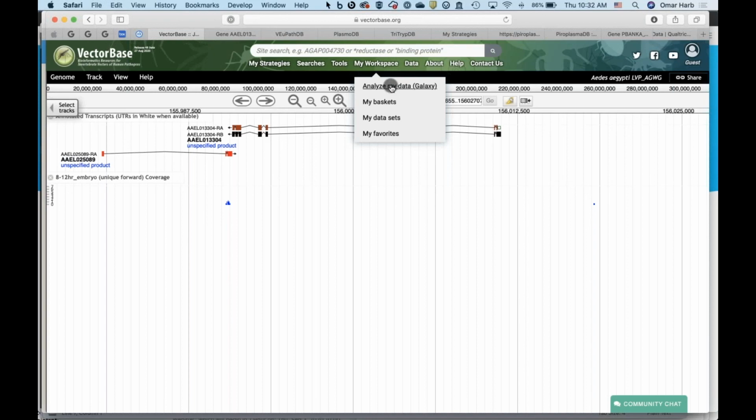And to do this manually, you can imagine a gene could have 1,000 reads or more aligned to it. And so you're going to have to try and look and count the reads. And so that becomes, I think, very laborious. And so my recommendation is for you to reanalyze and then use the appropriate tool for determining SNPs based on the aligned RNA sequence data. So hopefully that's helpful.